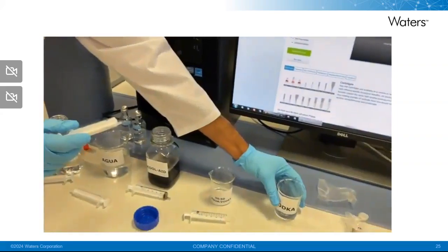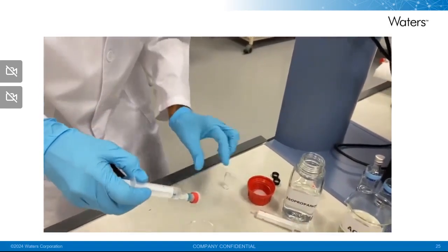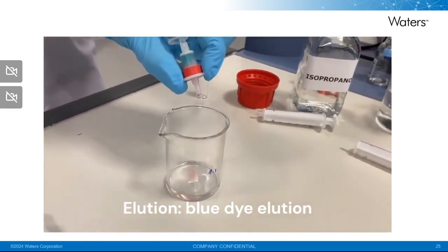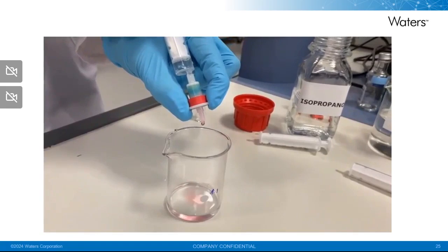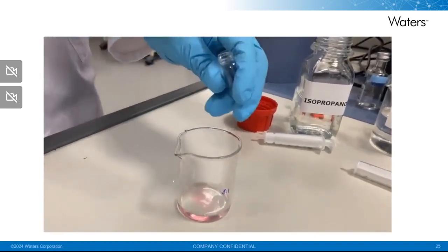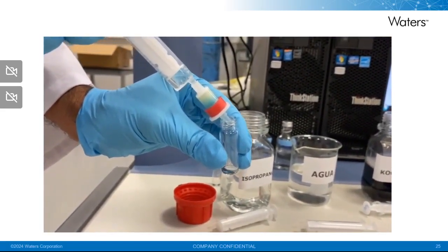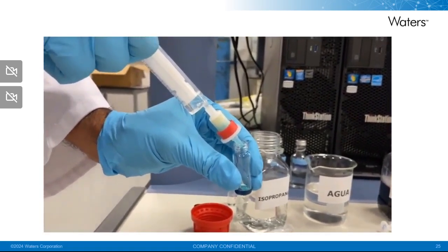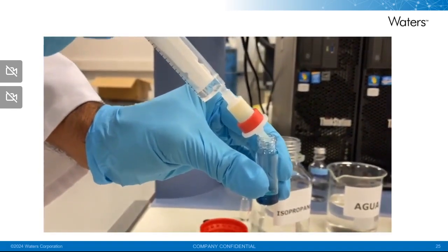And finally we are going to elute, and for that we use the vodka, so 40% ethanol in water, a strong solvent for reverse phase SPE. And again we have to perform the elution slowly, around 1 drop per second. And here again we see clearly how the blue begins to quickly flow through the cartridge, through the sorbent, and we can finally elute our blue dye without any hint of the red dye, which are the interferences. So you see that there's no blue left in the cartridge, while we have collected all the blue in the vial.